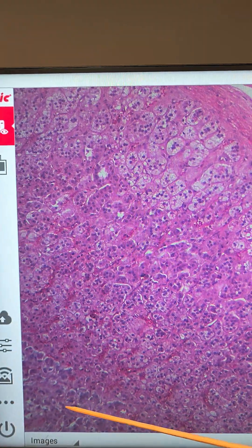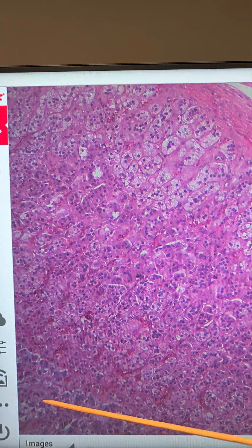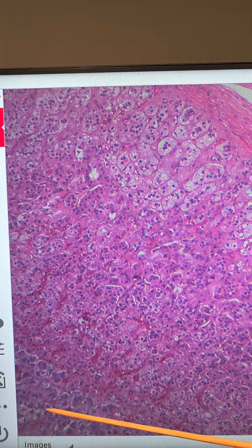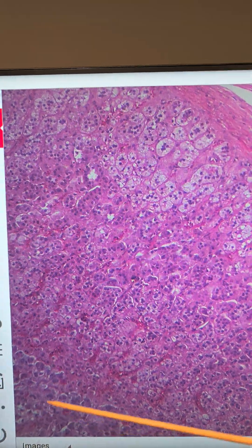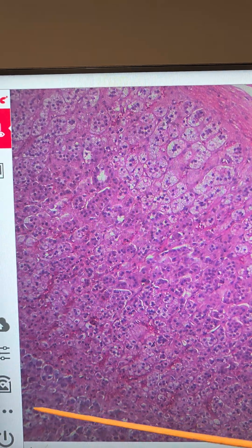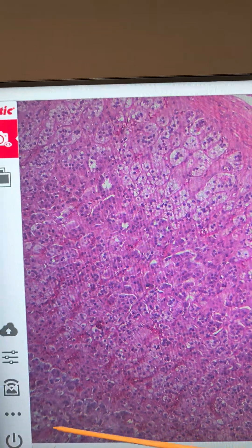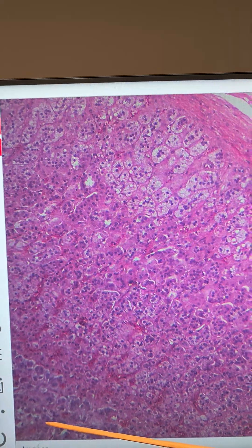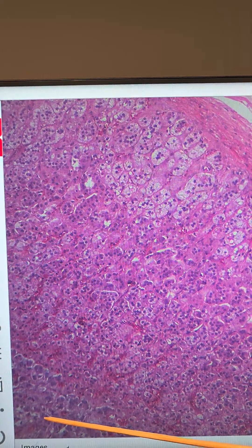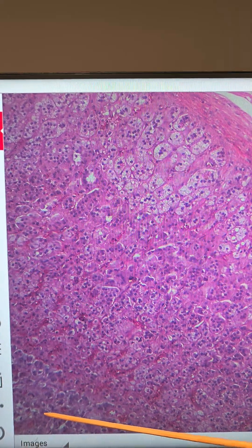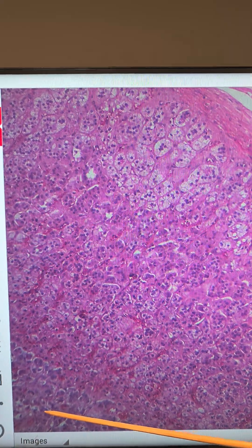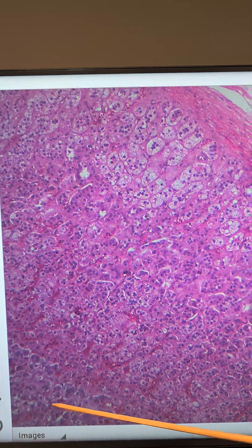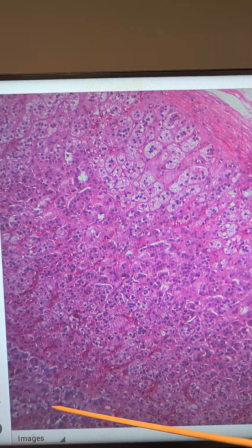Here again, we have the adrenal medulla. The adrenal medulla has cells that are known as medullary chromaffin cells, and again, these produce the catecholamines known as epinephrine and norepinephrine.